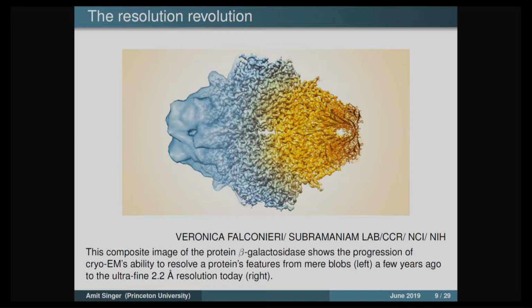The improvement in the quality of the map is mainly due to improvement in hardware, in particular detector technology. I don't want to go into the specific details, but now you can get to really high resolution using CryoEM. What you see here is a 2.2 angstrom resolution, and some reconstructions have even broken the 2 angstrom barrier.